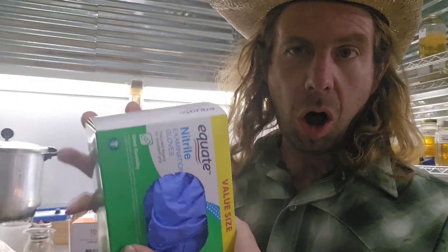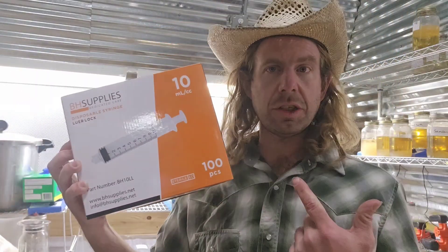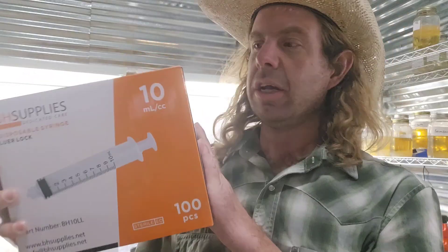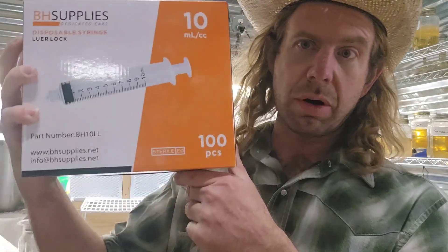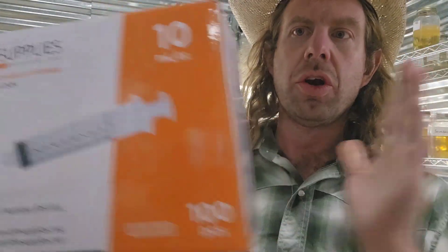Number fifteen: nitrile gloves — always use protection in the lab. Number sixteen: syringes. I like to use 10 milliliter syringes and I buy these by the case — I bought 1600 the other day. When you go to my website and get some liquid cultures, you're going to want to load some up yourself and you're going to want some 10 milliliter syringes. Number sixteen: syringes.